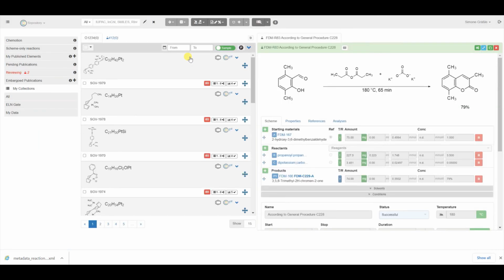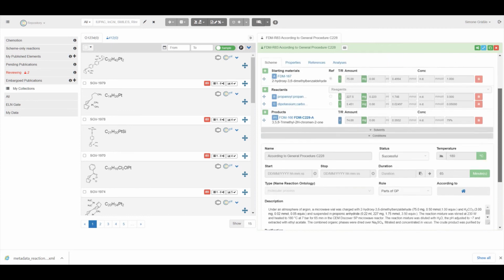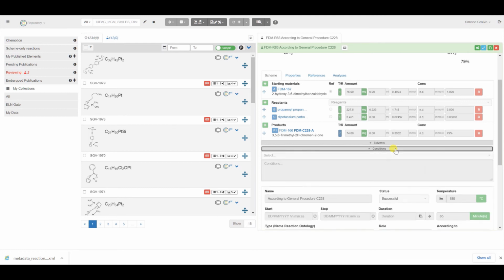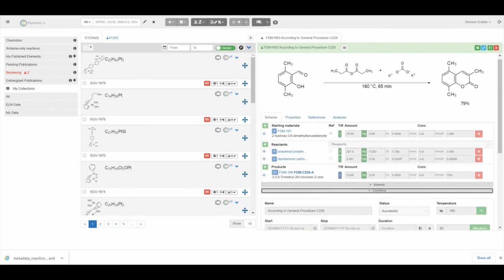Going there means the redirection to the reaction we searched for, and the link to the workspace now allows us certain functions that are not available via the landing page. So first of all, we see the full information. Here you see what the landing page offers us as well, but in principle you may search for other information, if solvents or further conditions are added, and you have the same view as given in the ELN.